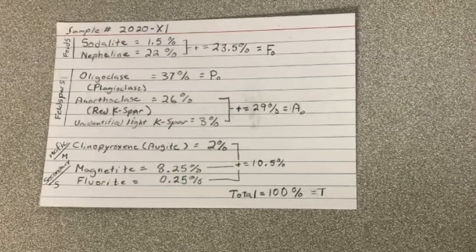But the percentages I got are basically here. What we have is our sodalite and nepheline together. We need to combine those to do this normalization. Since they're both feldspathoids, 23.5%. Now we have our 3 feldspars, actually. We have 1 plag, 2 K-spars.